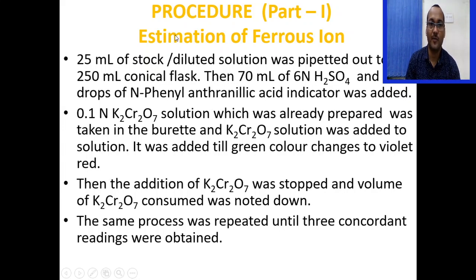For estimation of ferrous iron: pipette 25 ml of the diluted stock solution into a 250 ml conical flask. Add 70 ml of 6N sulfuric acid and 10 drops of N-phenyl anthranilic acid as indicator. Fill the burette with 0.1N potassium dichromate solution and note the initial burette reading. Add potassium dichromate until the green color changes to violet-red — this is the end point. Note the final burette reading; the volume consumed equals final minus initial burette reading. Repeat until three concordant readings are obtained.